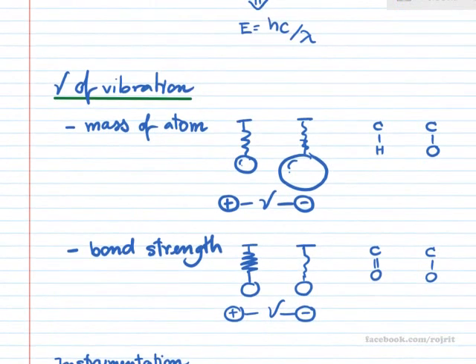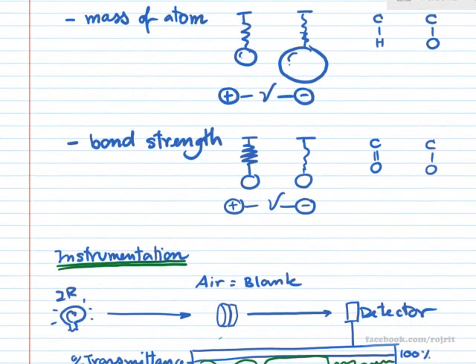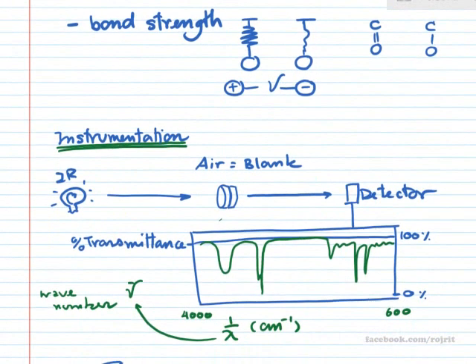So if you have different chemical bonding in the molecules, they absorb different regions of the IR. Anyway, there are just two main factors: the mass of atoms and the strength of the bond. By these two factors, you can relate the region of the chemical bonding in the molecules by IR spectrum.